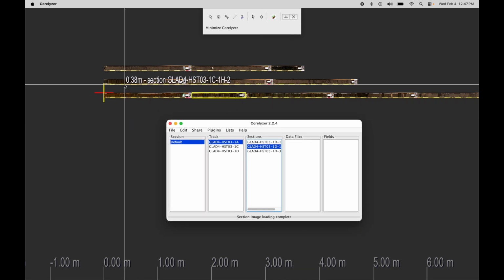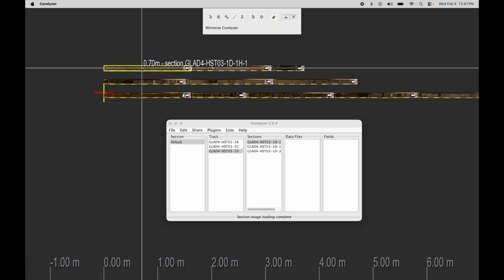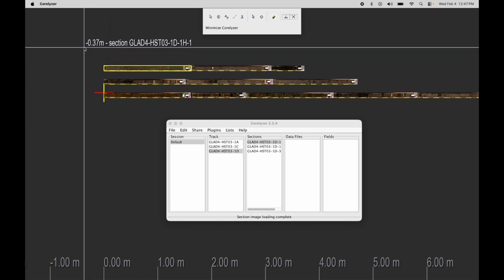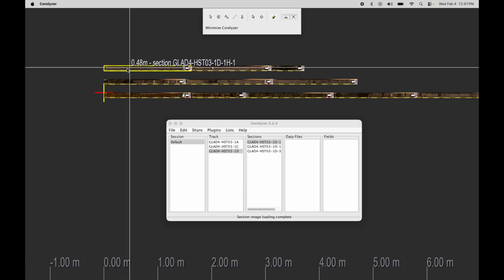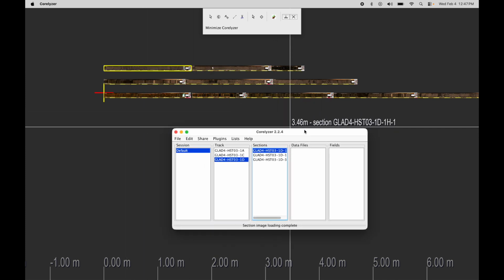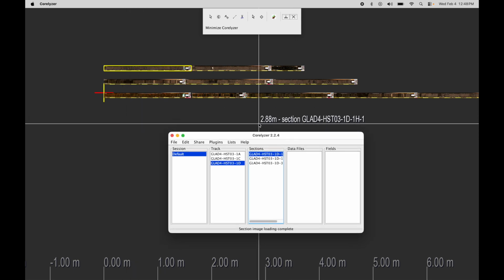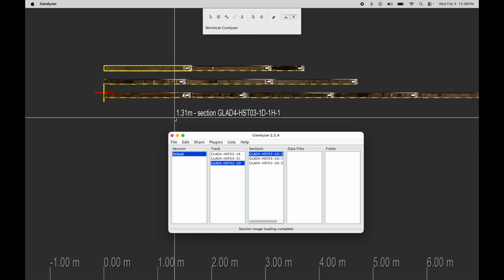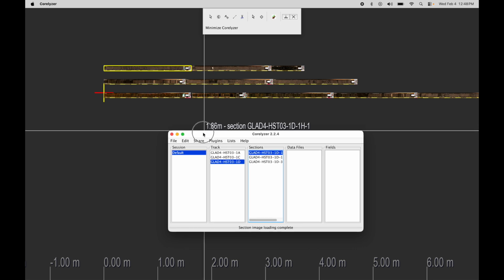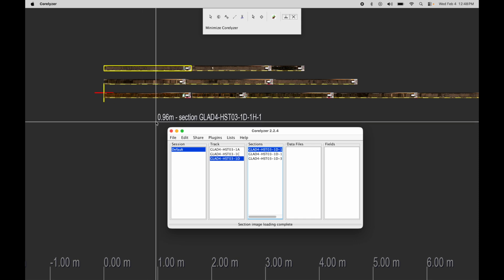You can see that Corelyzer has added 2 entirely new tracks, one for the 1A cores and one for the 1D cores. It adds those above the original track. The position of these can be adjusted. We'll talk about that in another tutorial. So again, that demonstrates Corelyzer's auto-sorting and auto-dividing into appropriate tracks based on file names. As long as your names follow those conventions, it should be fairly straightforward to import a whole batch of cores at once and have them placed in the correct tracks.